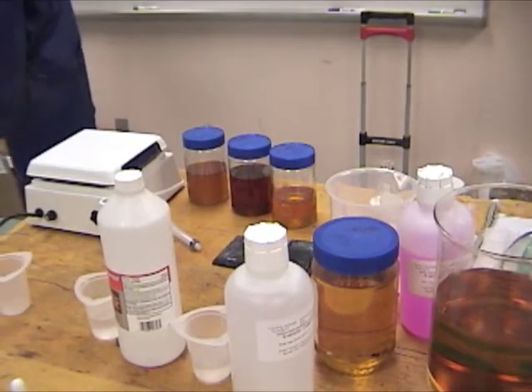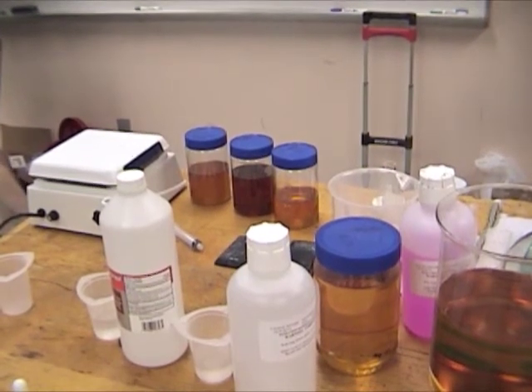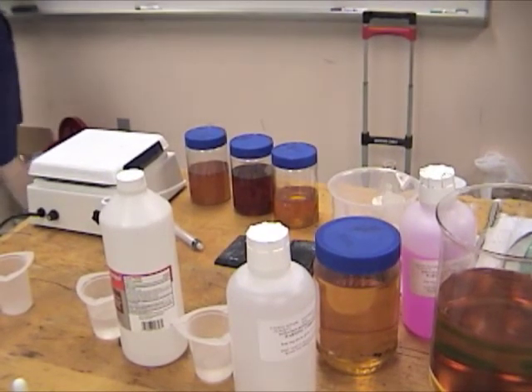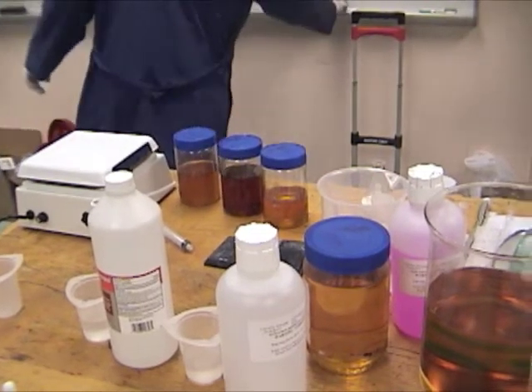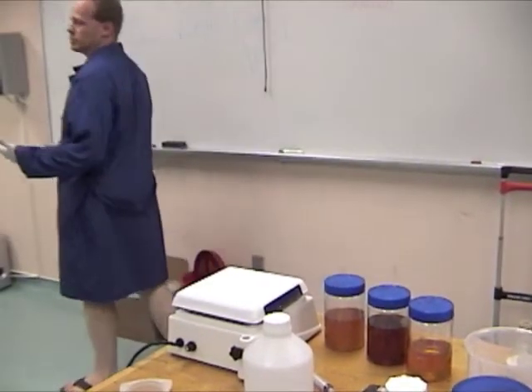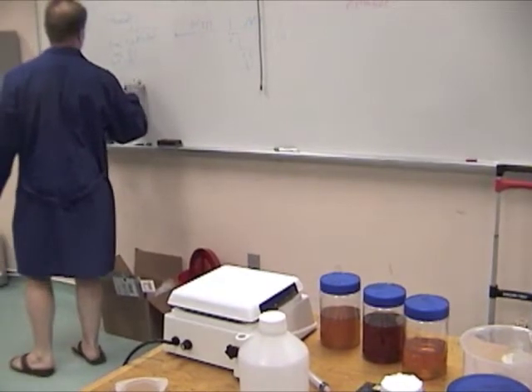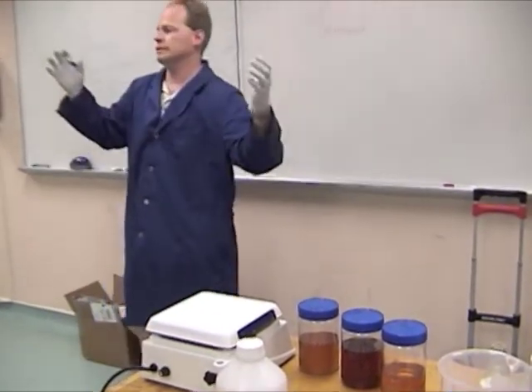So I'm going to take this and put it in my titration cup. Then I'm going to take measured amounts of this and just put it in and watch for it to turn color. I want it to turn color and stay that color for 30 seconds or more, because sometimes it can be neutralizing, and it'll come back a little bit acidic.